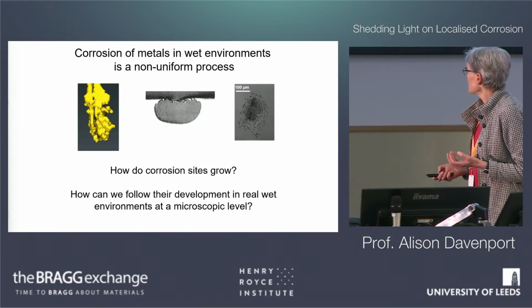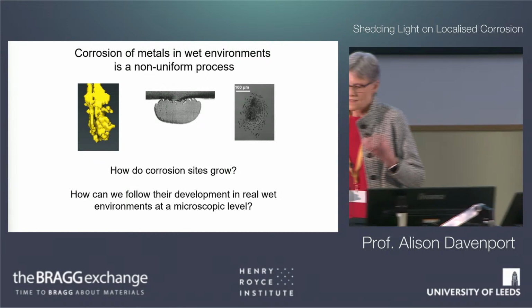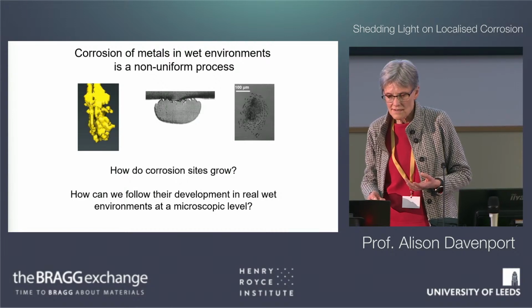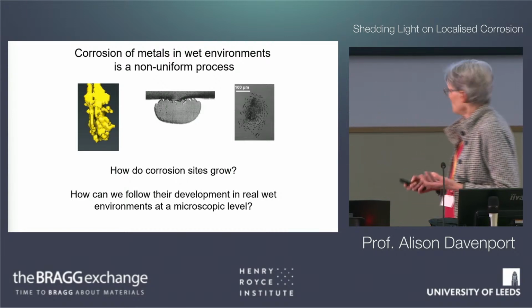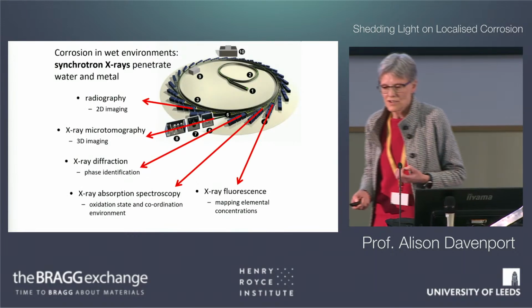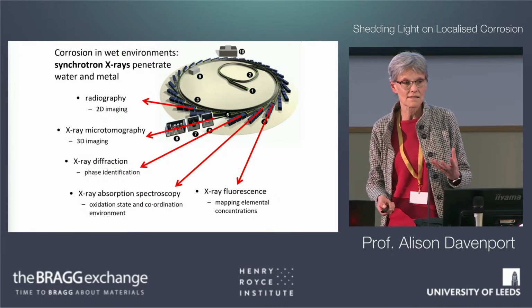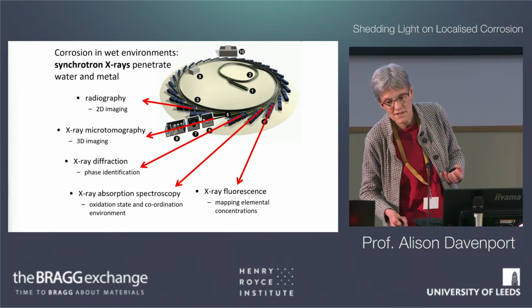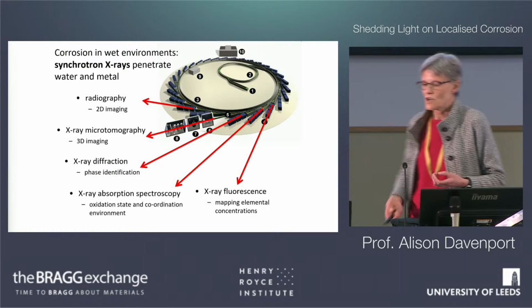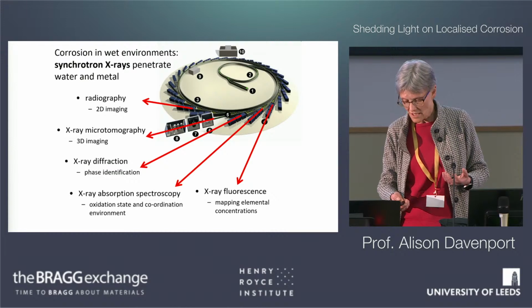And the other thing that's really key here is that we need to be able to see how these things develop in wet environments and characterize them. And to do that, we need in situ characterization. So a lot of the work I'm going to be talking about is using high-intensity X-rays at synchrotrons, where you have lots of different lovely beam lines with a whole variety of techniques, including imaging and diffraction for characterizing materials.